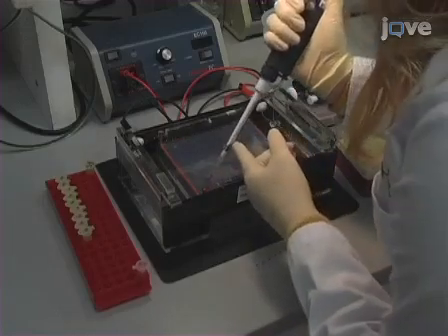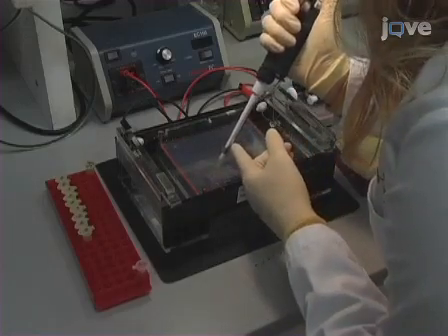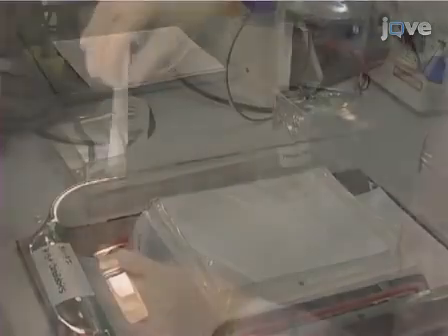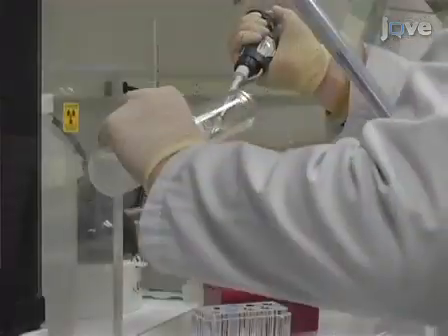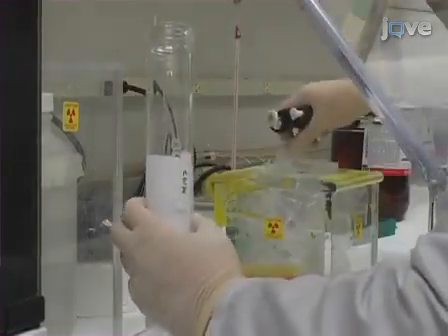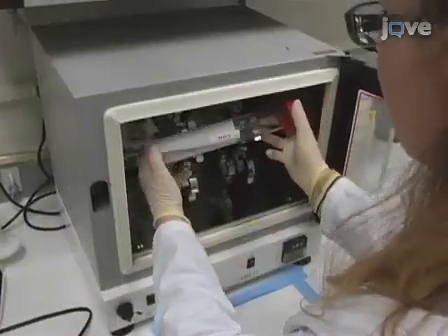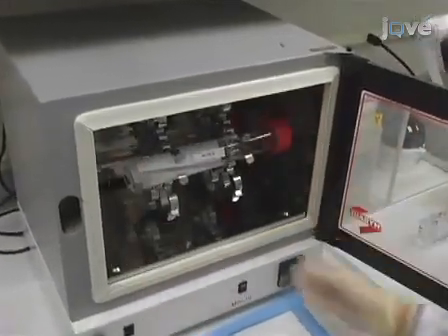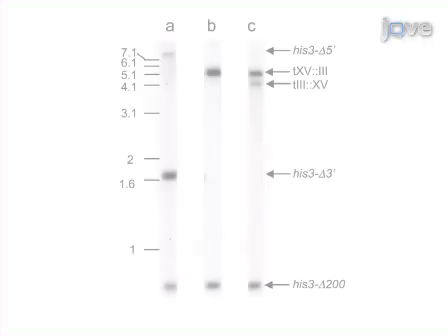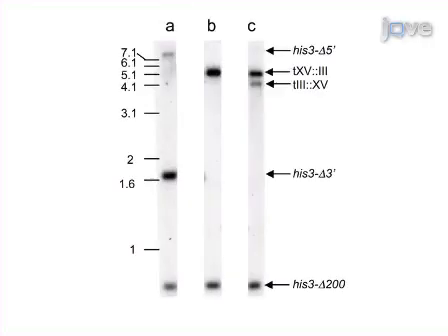Separate BamHI digested fragments on a 0.7% agarose gel, and then transfer to a positively charged nylon membrane. Hybridize with a P32 labeled probe, obtained by random priming with a 1.8 kilobase BamHI genomic clone containing the HIS3 gene. Visualize DNA fragments by autoradiography or phosphorimaging.